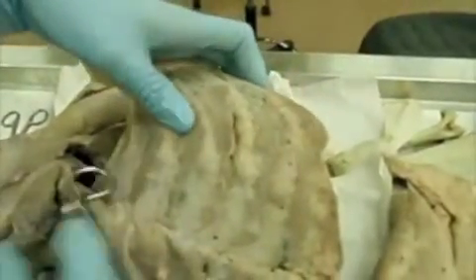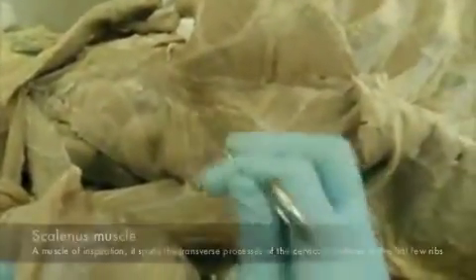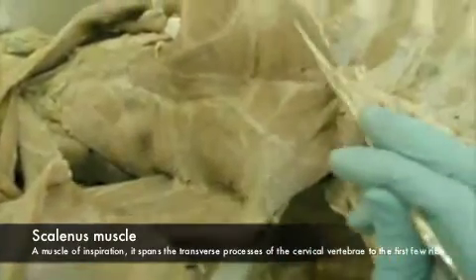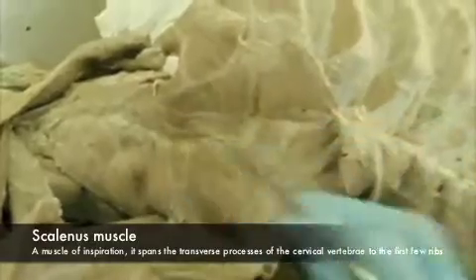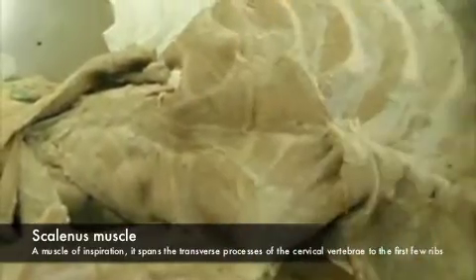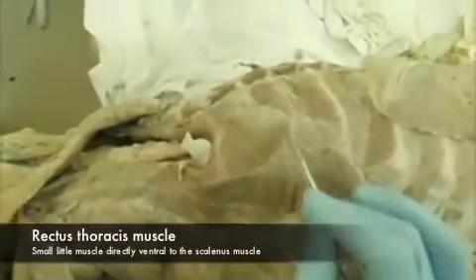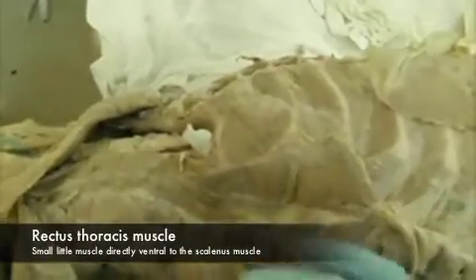Next, I need some ribs. Just look a little closer, and you'll see them. On the more ventral aspect, so I just raised the limb. Here we have the scalenus muscle. I'm just going to mention this muscle because I find it important. So your scalenus. And this tiny little spindle-shaped muscle, that's actually your rectus thoracis. Okay, rectus thoracis, and this is your scalenus here.